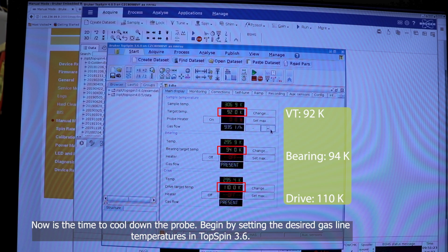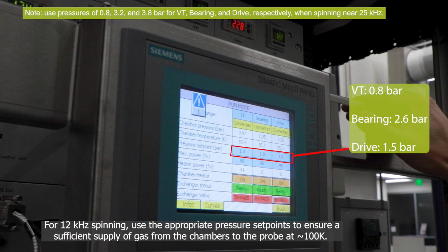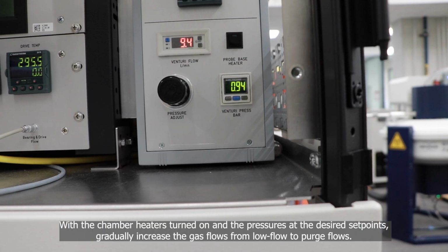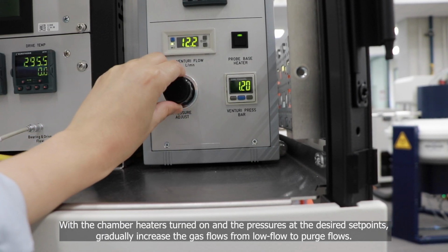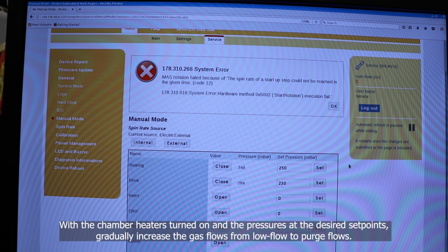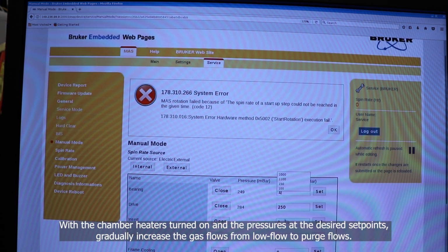Now it's time to cool down the probe, so begin by setting the desired gas line temperatures and also the desired pressure set points as shown on the screen. With chamber heaters turned on and the pressure at the desired set points, gradually increase the gas flows from low flow to purge flows, and allow the probe to purge with warm gas for a few minutes by opening the eject.